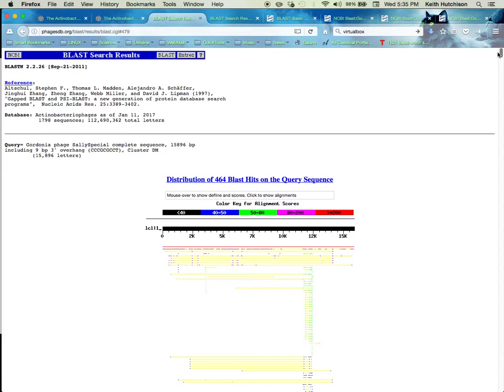And we use BLAST as a way to find out what else our phage is related to. In this particular case, Sally Special really only has one other phage that's related. Cuke has no other phage that it's related to, because it's a singleton. Well, it has some relationship, but very little relationship to anything else. TBRI 12 and Shere-Khan are both parts of the E cluster, so they have multiple phage they're related to, and we would see that in a BLAST alignment.